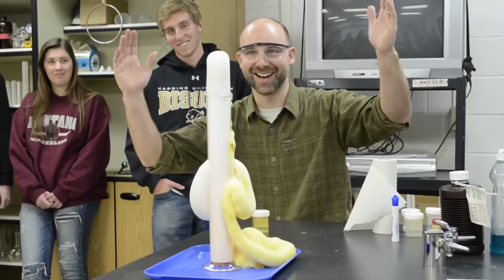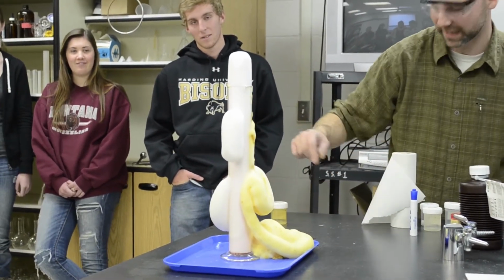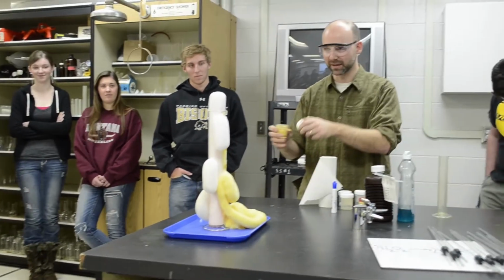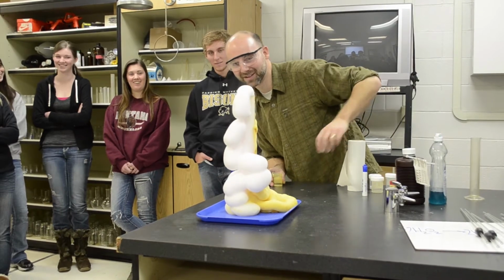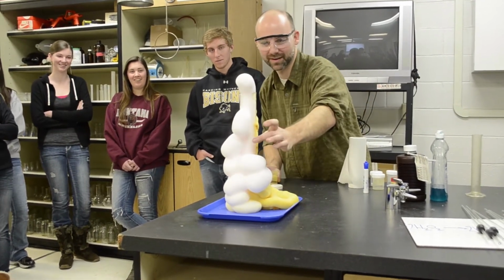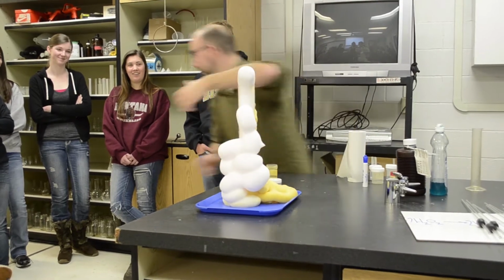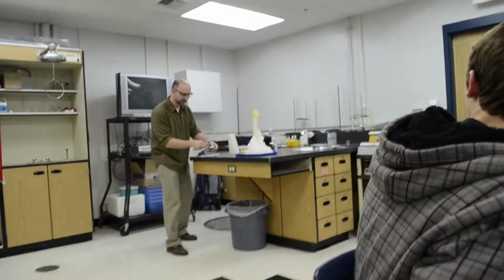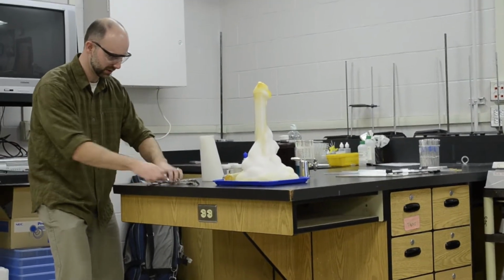Whoa. Too top heavy. What's all this brown stuff? Yeah, that's the sodium iodide. Oh, I don't have any more hydrogen. Ooh. Oh, wow. It's on me. Excuse me. That's enough. We probably shouldn't look at it.